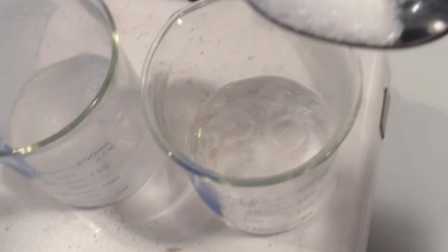There's a lot of work for everybody to do. People can be measuring, people can be getting equipment, people can be adding salt to the water. Everybody needs to be aware of their surroundings because we're going to have a lot of hot chemicals and we don't want anybody to get hurt.